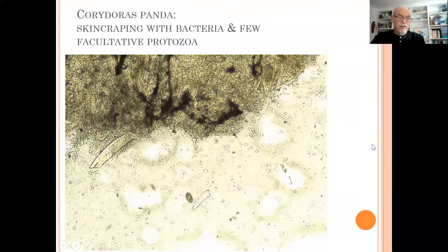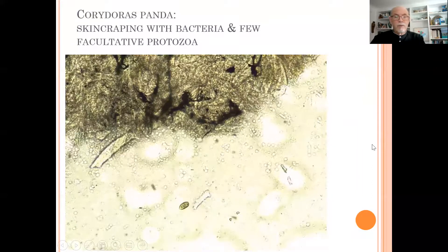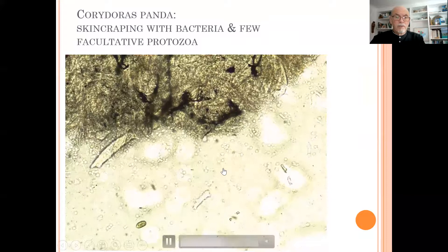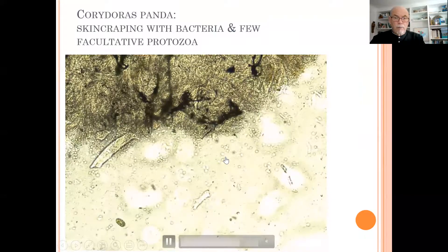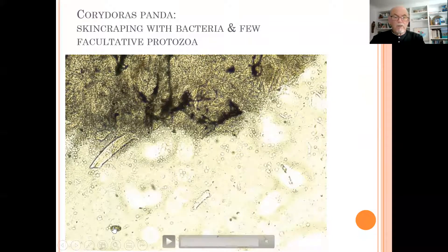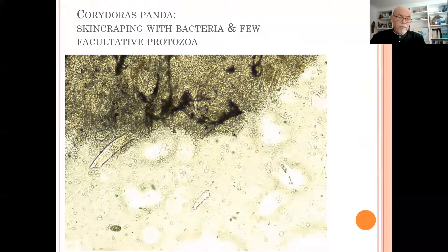We start first with the skin scraping. Here at 100x magnification, we see a few facultative parasites — that means they are not the cause of the problem. We see only one; I think it's a Tetrahymena, and here looks like a kind of Chilodonella, but only one of each. That means it's not a parasitic infection.